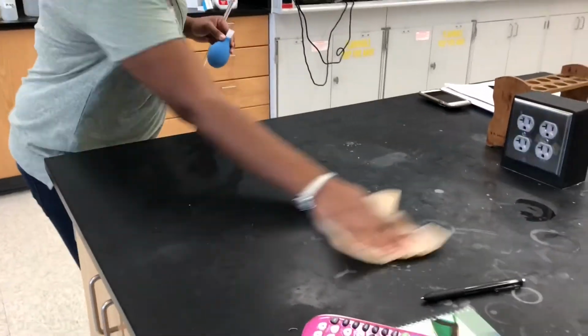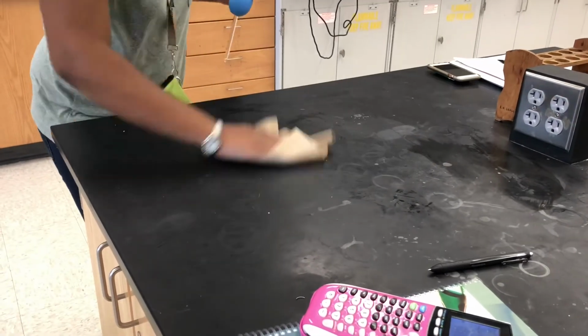Before leaving the lab, it is important to clean off your lab table for the next group behind you.